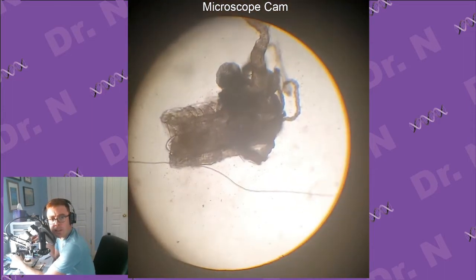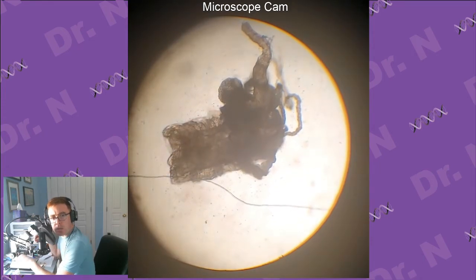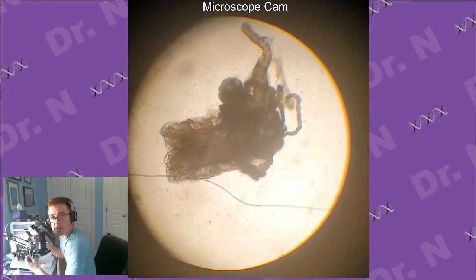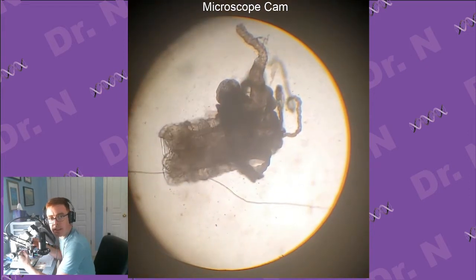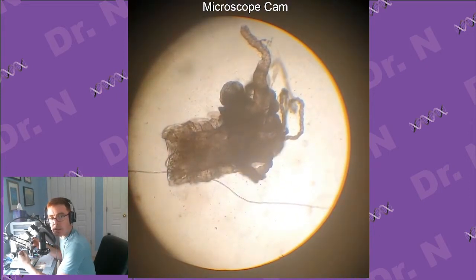Okay. Ooh, that was sort of successful. I'm gonna have to pull away some of this to kind of see what we've got. I think the salivary gland should be in there, but we'll see.